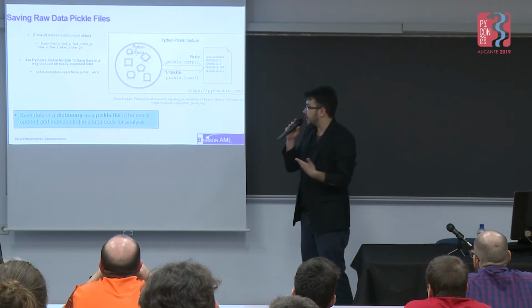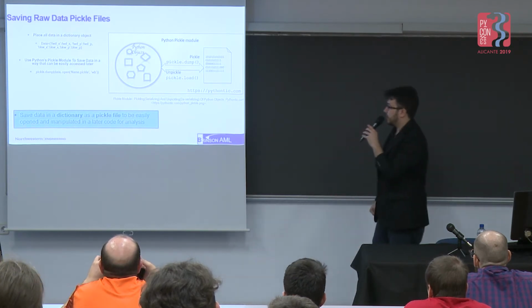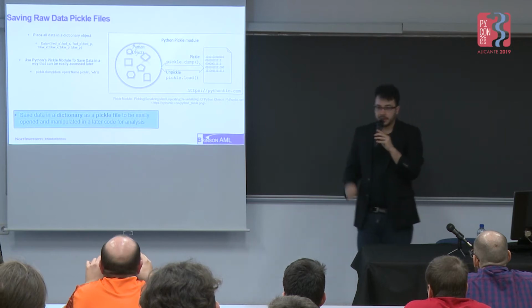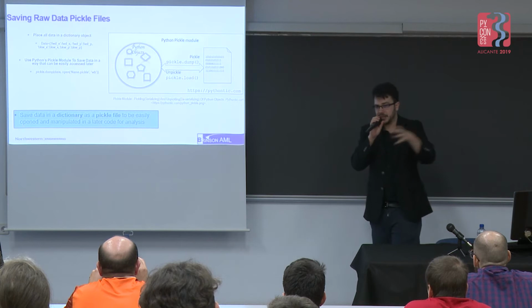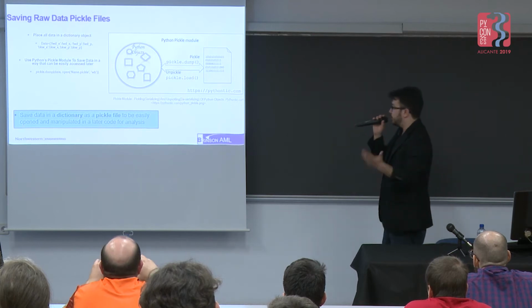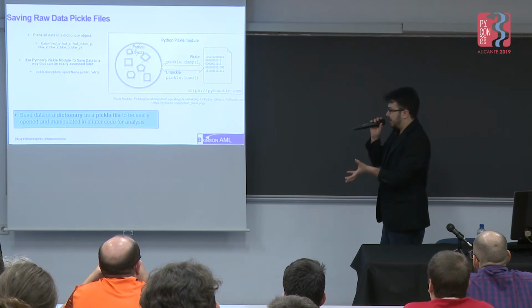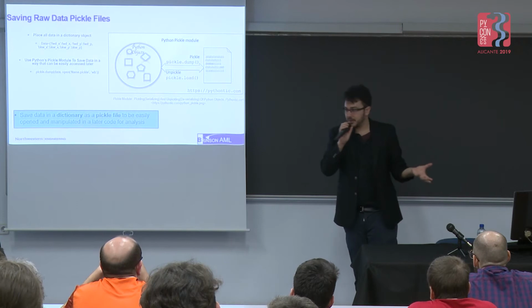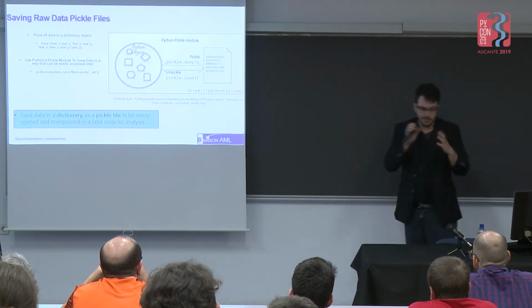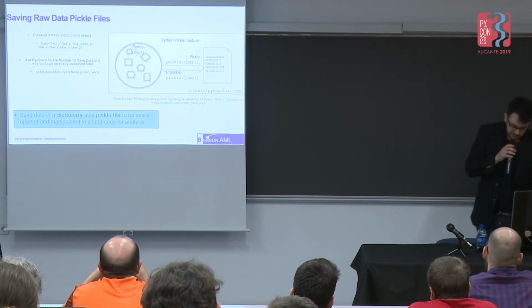We can then store it as a dictionary, and I store it using Python's pickle module, which is a way that easily stores Python objects so that you can access them later. You basically just use pickle.dump with the file you want to save and the name of the pickle file, and then to access it later in a different Python script, you do pickle.load. It's a pretty convenient way to store and access information in Python.